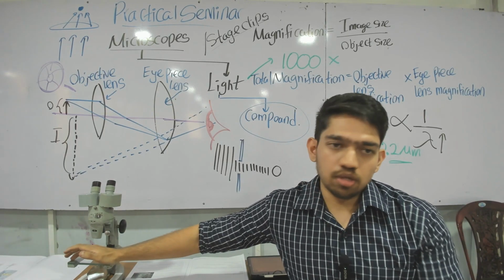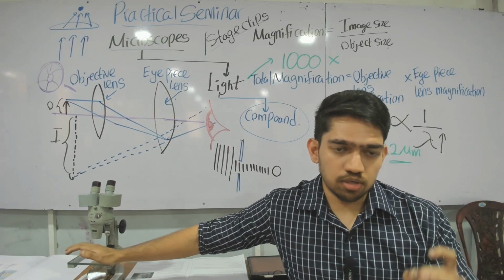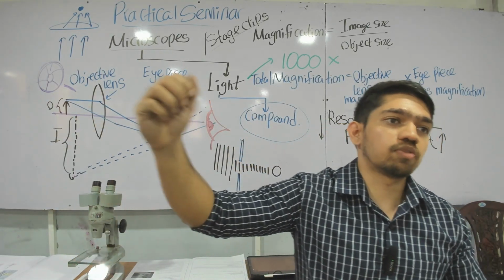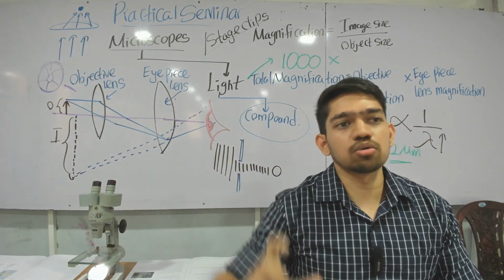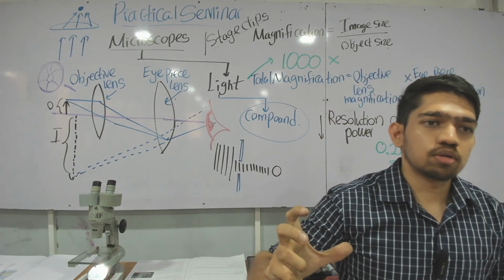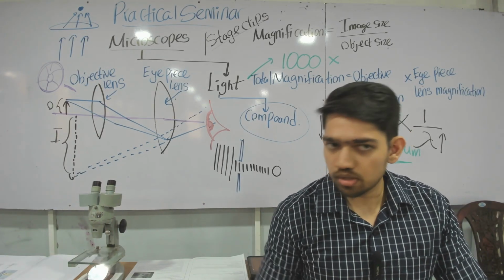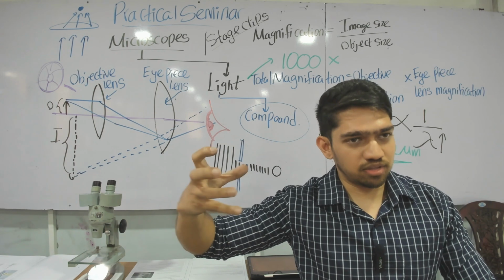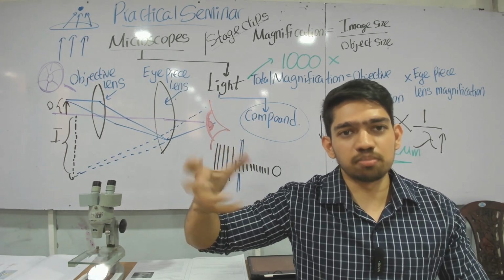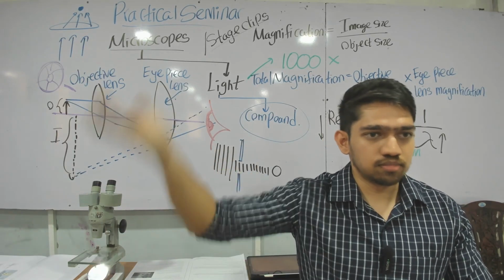Then you can lock this coarse knob. In certain advanced microscopes, if you want to use the next knob, the fine knob, you have to lock the coarse knob. Then the coarse knob you can't rotate. Sometimes you can't rotate the fine knob until you lock the coarse one. There are cogs inside. The coarse one has bigger cog wheels, I think, so it moves the lenses faster.